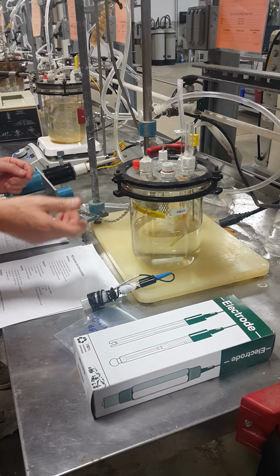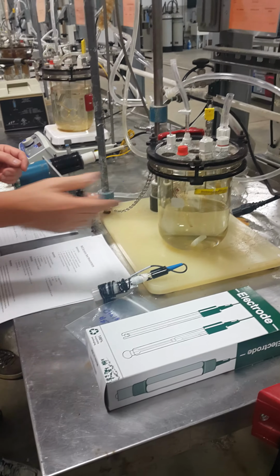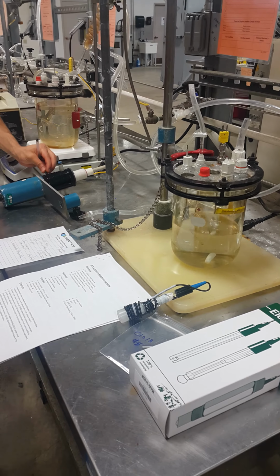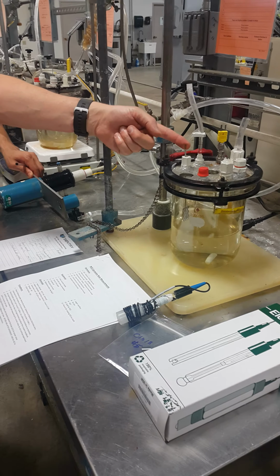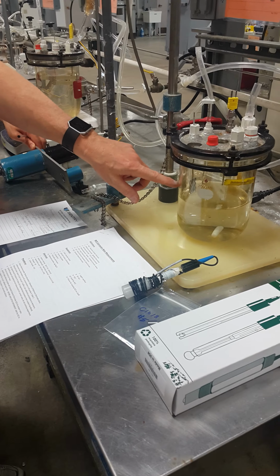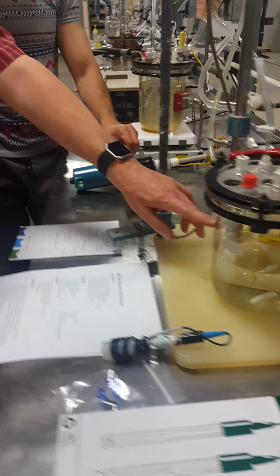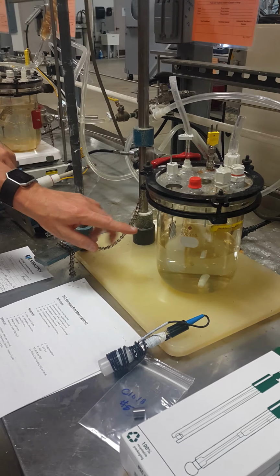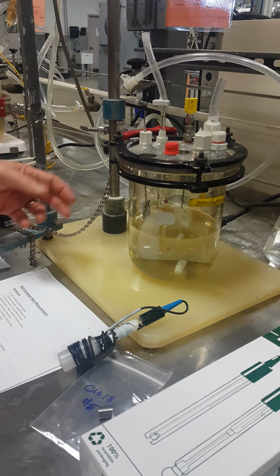So we have a 3 electrode system that we use. I'm jumping way ahead of myself here, but I'm going to go ahead and do it. We have a counter electrode here, which is that. It's a platinum coated titanium mesh. And so it works very well. It's a mesh because it's a lot of surface area.